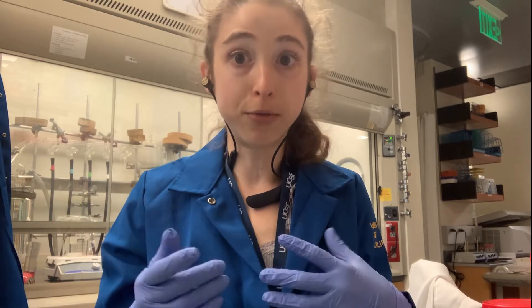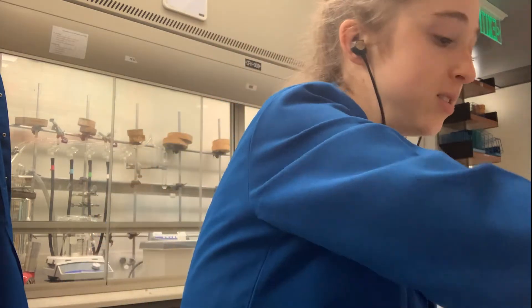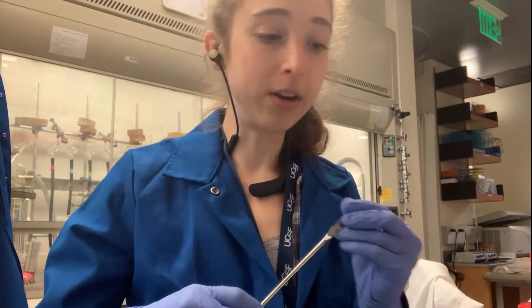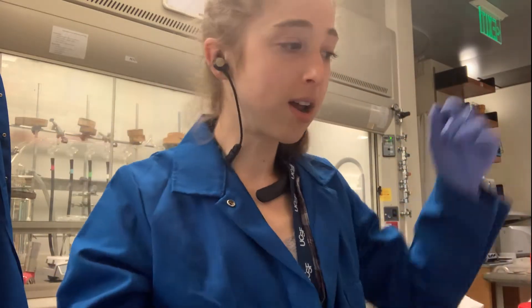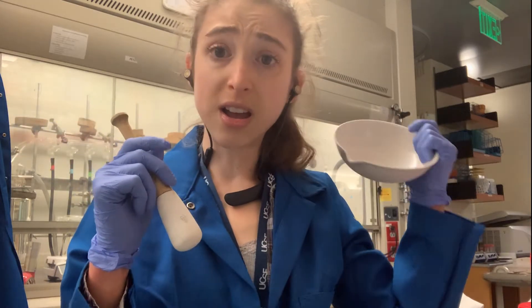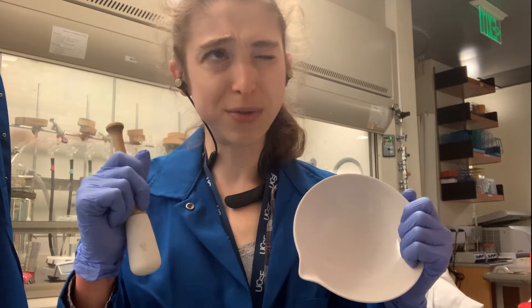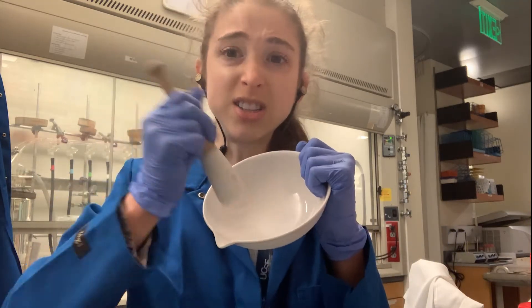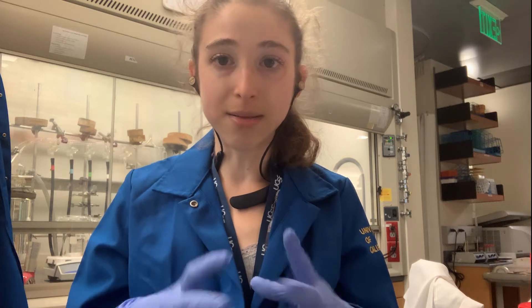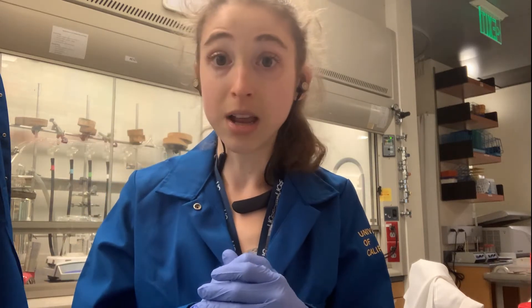Avoid clumps in the first place. If you can't avoid them, at least de-clump them before putting them in your liquid. The easiest way is just a spatula — but be careful not to jam your finger. You can also use a glass rod, and if all else fails, a mortar and pestle, which I had to resort to yesterday with some salts that hadn't been used in about a decade. A colleague also gave me a cool tip: put it in a sonicator bath for a little while, give it a zap, and that can help break up the clumps. Thanks, Jordan, for that tip.